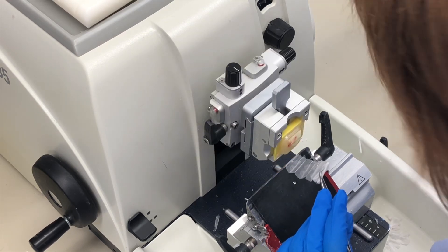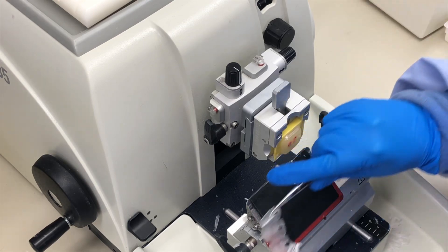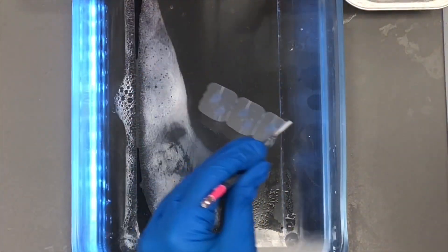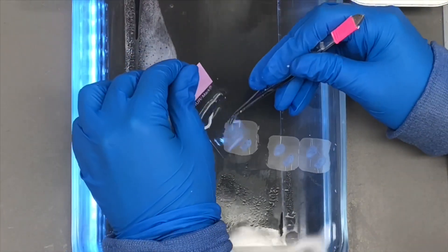Upon obtaining a full face, we start to cut the section before we put it into the water bath. We use the water bath to flatten the tissue as much as possible and separate the sections. We then put it onto the slide.